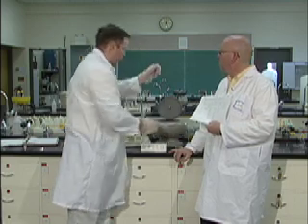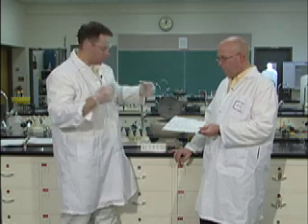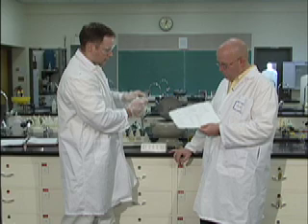Okay, so now to prove that this is iron solid in here, we have to dissolve it first. So we have to dissolve it back into solution. And what we're going to add is 6 molar hydrochloric acid again.